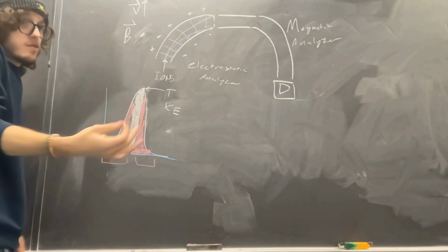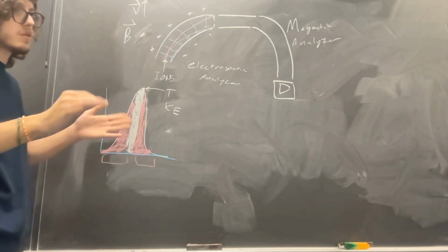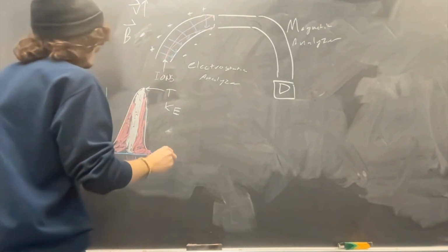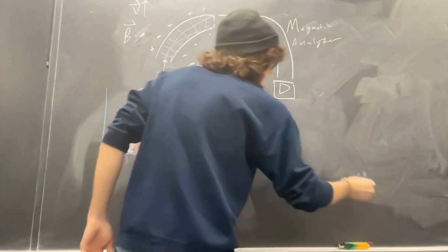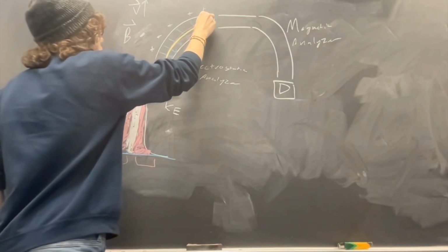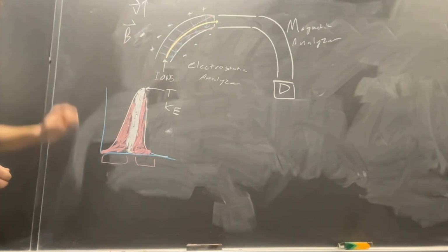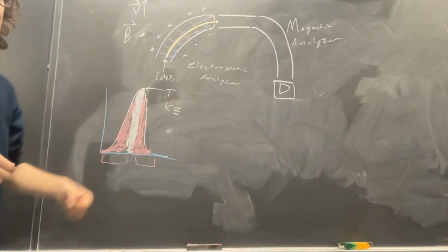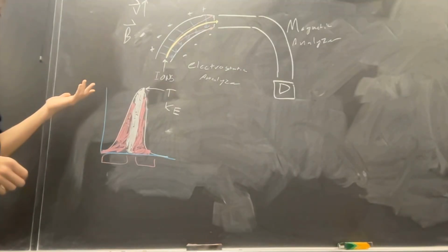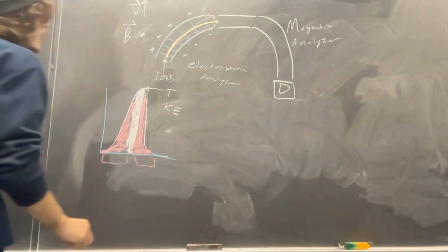But what about the just right molecules? If we set the electric field to just the right strength, and this requires some trial and error, we can encapsulate the perfect trajectory. What this looks like, with the yellow chalk, is that it's deflected perfectly into the slit. We are encapsulating just one kinetic energy, and hopefully it's the most abundant, because if it's not, you're going to get very bad signals, unless you set your transducer or amplifier to a higher setting.